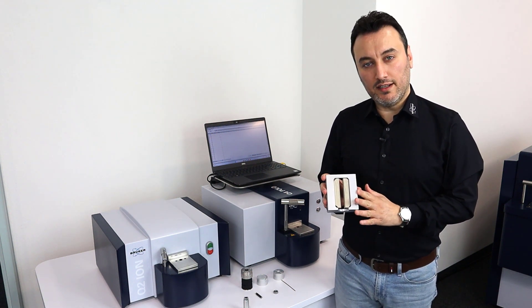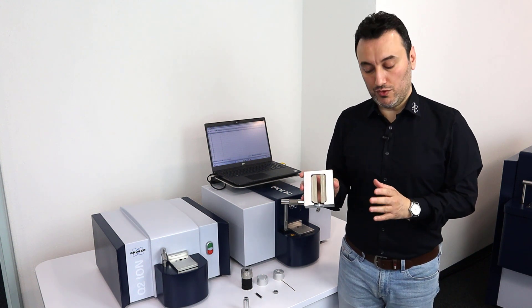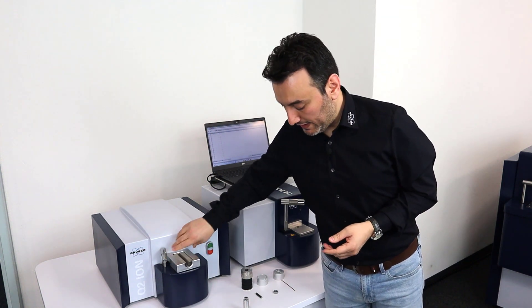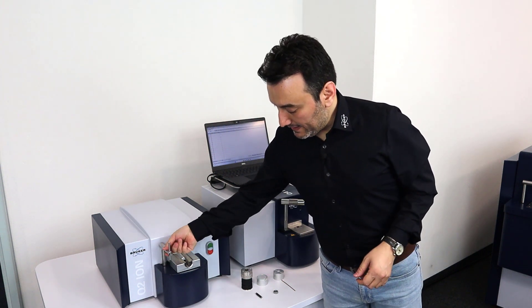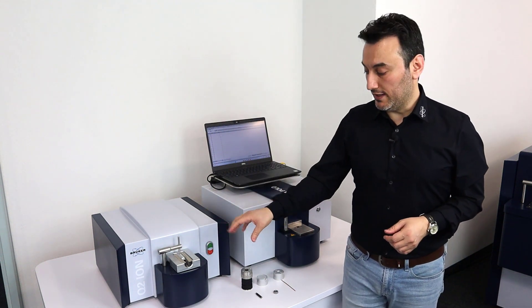With this tube adapter we can analyze tube samples with 12 to 30 millimeters of diameter. All I have to do is place the adapter on the spark stand plate, then insert my tube sample right in here, put the clamp on it, and the system is ready to analyze the sample.